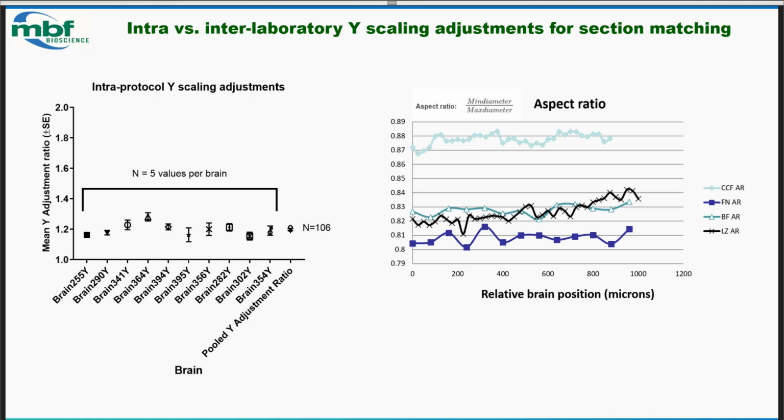Not surprisingly, if you go to other laboratories with slightly different protocols, you get different correction factors, but we're finding that they're all pretty consistent within a laboratory. So that was an impactful thing, and it really impacted the direction that NeuroInfo moved forward in: you can start with a starting point of the scaling factor for every brain you work with.